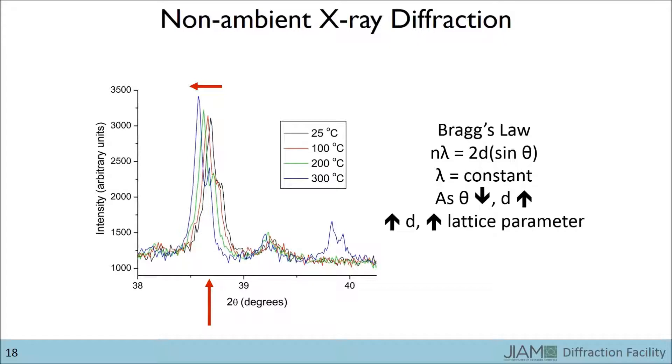From these data, we can determine the values of the lattice parameters as a function of temperature, and therefore determine the thermal expansion.